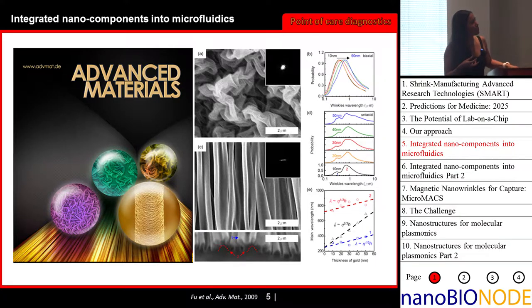We looked at the scaling of the different materials depending on the stiffness of the thin films of metals that we're putting down. So we're talking about gold or silver. You can basically predict this: we took SEMs of these, and then we took the fast Fourier transforms to figure out the size distribution of these features in 1D and in 2D.